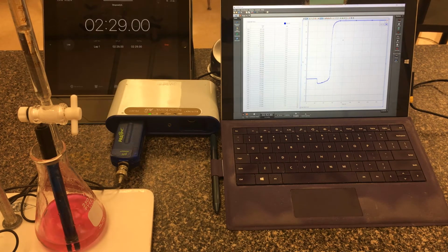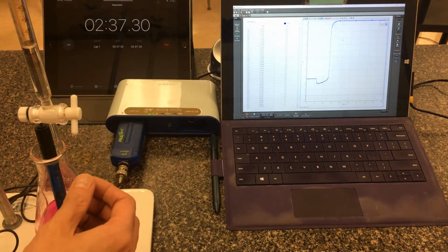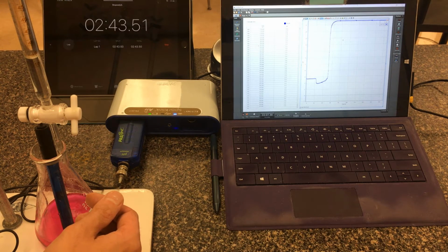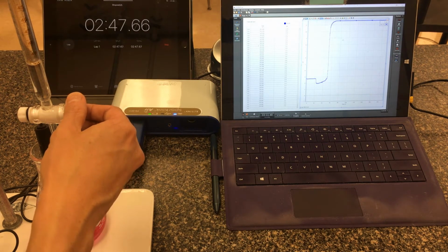And I'm going to hopefully do it for you one more time, a little bit more accurately, a little bit more tedious, but again, all we're after here is a titration curve like this, and then we can sample our data. So we're just about down to the 50 here. This has been dropping dropwise. And I'm just going to close at 50 here. Okay. And there we go.